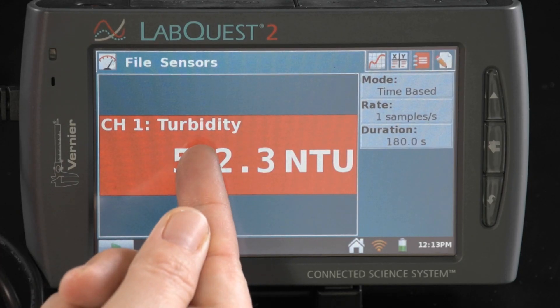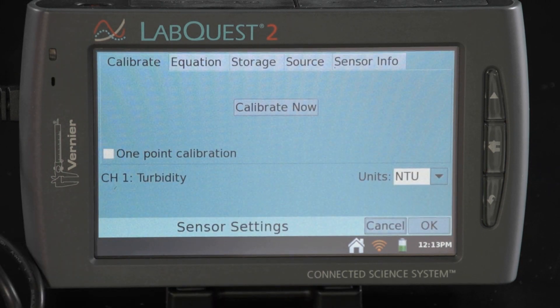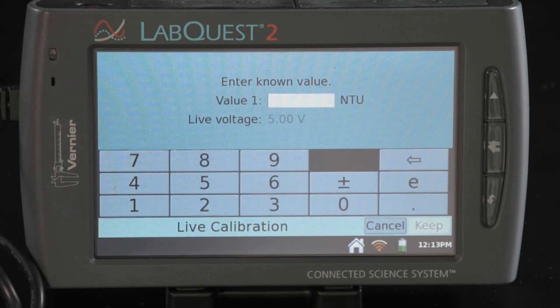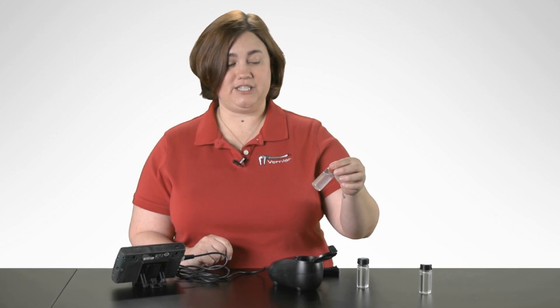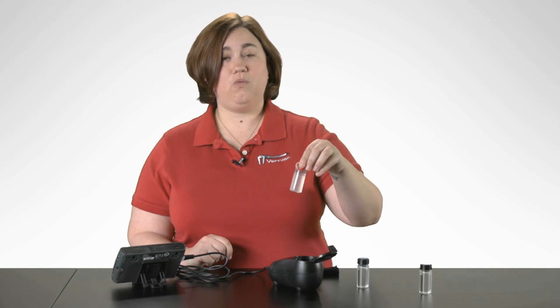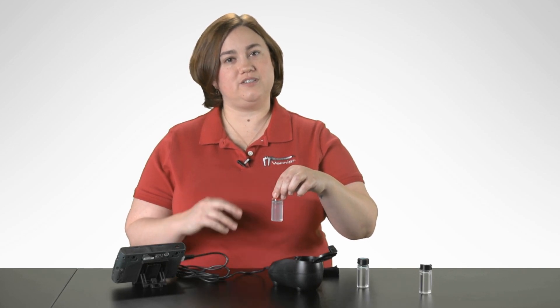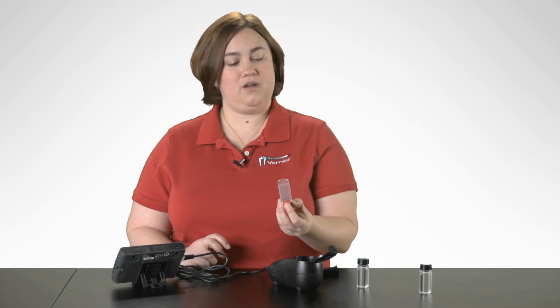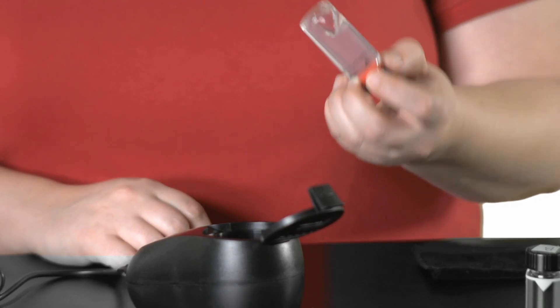In order to do the calibration, first we're going to tap on our meter screen, enter the calibration screen, and then tap 'Calibrate Now.' The first one we're going to measure is our 100 NTU sample. I want to gently invert this about four times to make sure that the standard is evenly distributed. I don't want to shake it because that could introduce bubbles into the sample that could affect its reading.